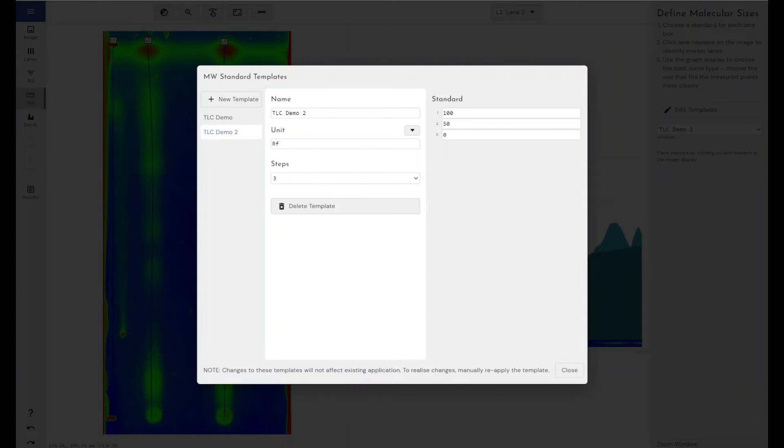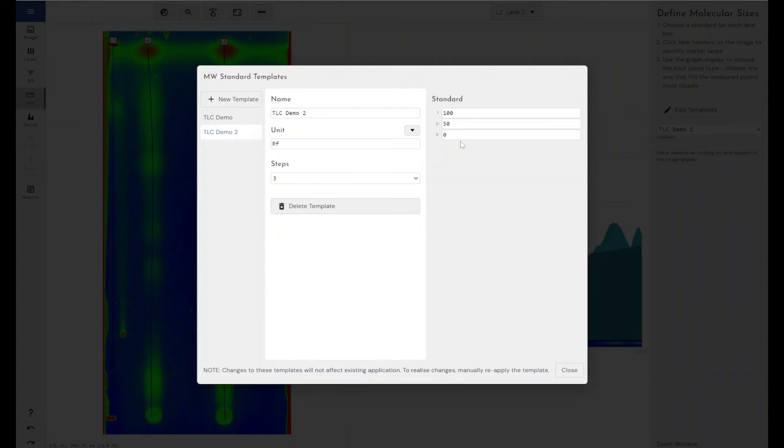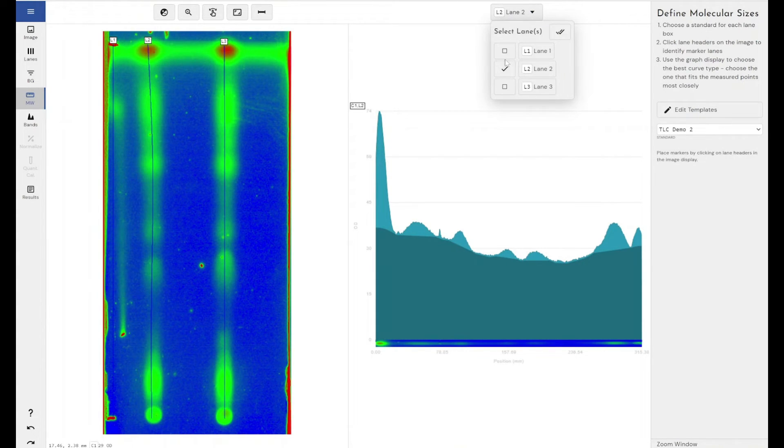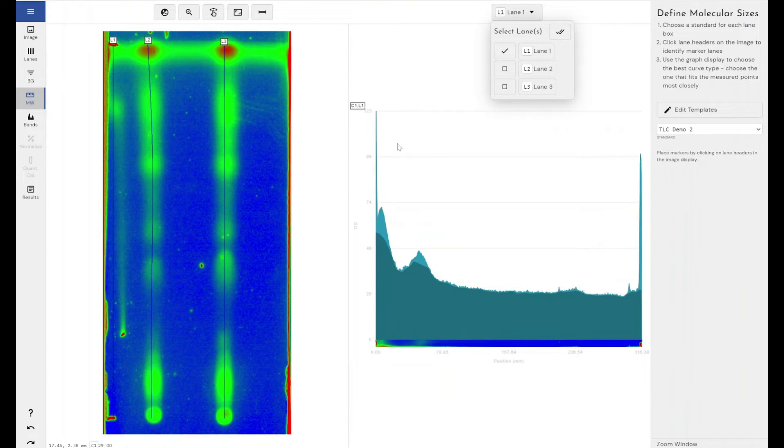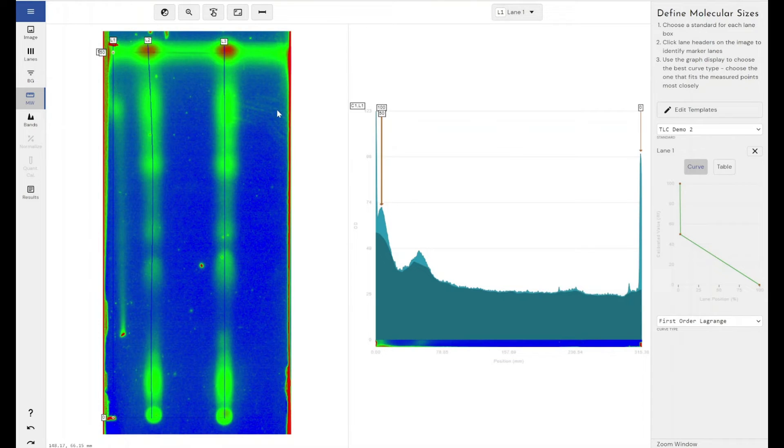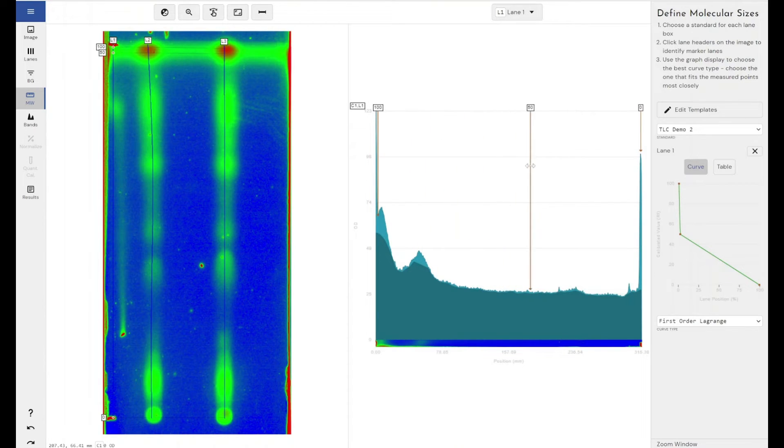So I've got, call it TLC Demo 2, I've named it, I've put the units as RF. I've got my three steps, so I've got 100%, 50% and 0%. So this is just a measure of, this is the same as RF being 1, 0.5 or 0, I've just represented it as percentage because it's easier to work with. So if I come through, if I close that, so now if I left click on my, just make sure I've got my first lane selected here in my view. So if I just left click on the top of my lane, you can see that because there are no bands on this lane, it's just dumped the lane markers wherever it wants. So what I'm going to do is just left click and drag these along to various points in the lane.